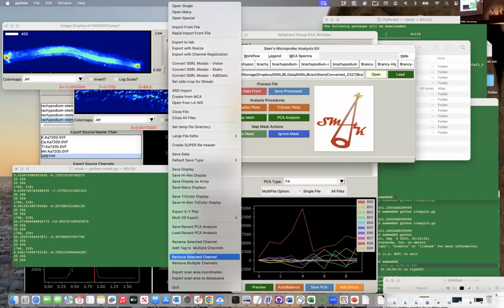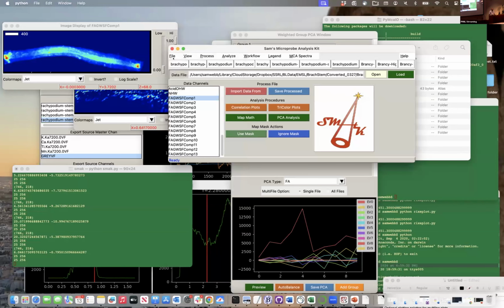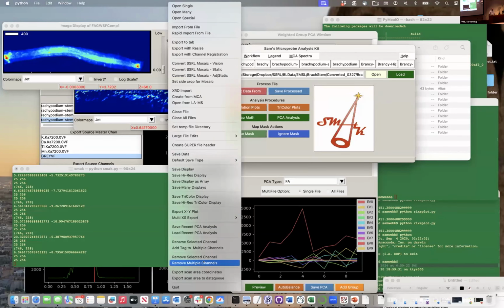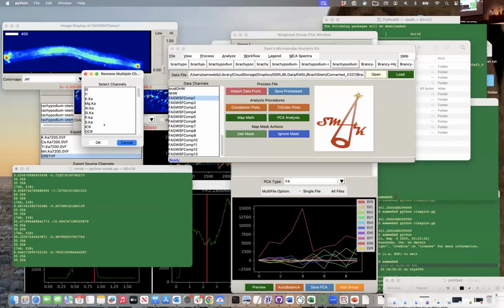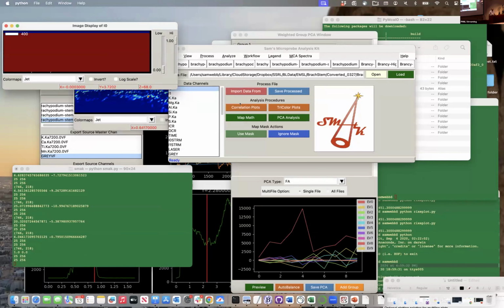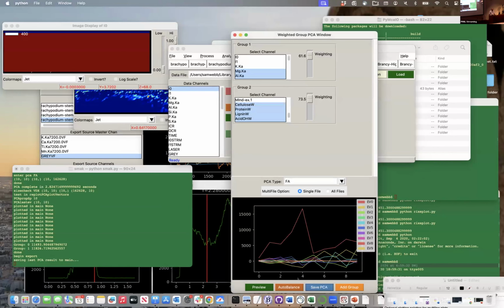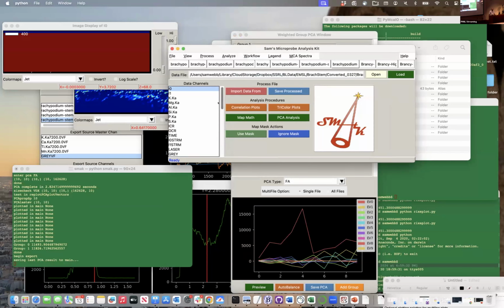You may realize that you created a channel that you don't want anymore. And you can go down to remove channels. You can get rid of all that old data that I made when I was doing this initially. And now we can do it again and say, save the PCA. And now we have all our new channels here.